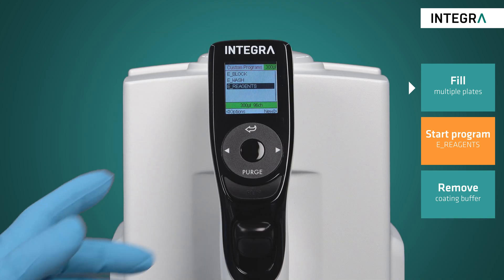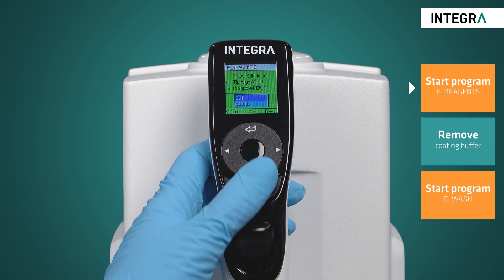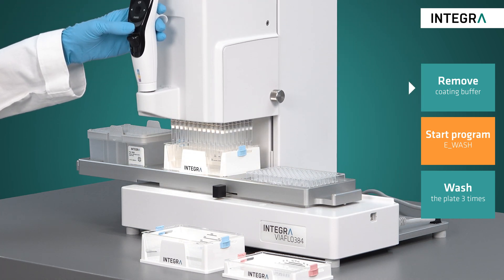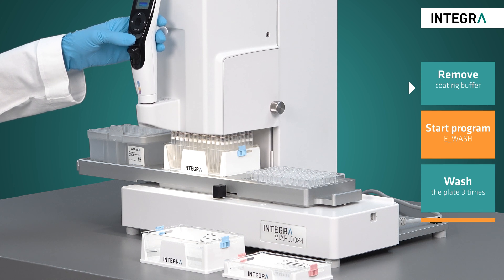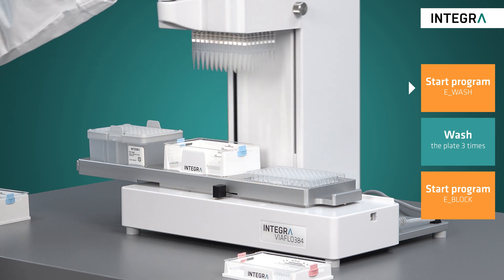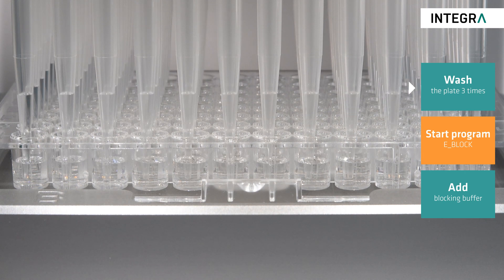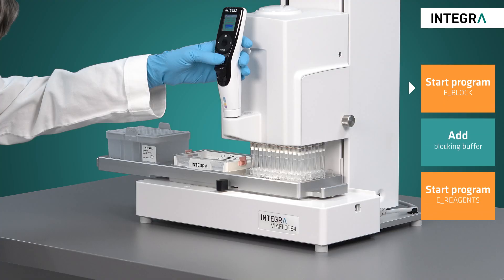After incubation, the next step is to block the plate. The corresponding programs are selected on the pipette. It includes removing the coating buffer as well as multiple washings of the plate and the transferring of the blocking buffer. Since all wells are treated at the same time, this ensures not only the consistency of the assay from well to well, but also the reproducibility from plate to plate. The height of pipetting is also set to be exactly one millimeter above the bottom of the plate and no lower, to prevent the tips from scratching the coated surface.